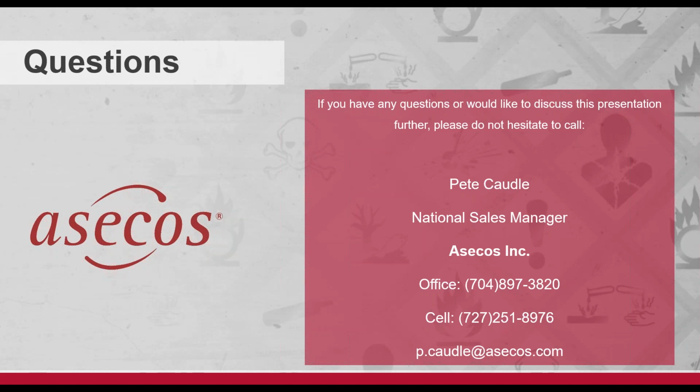But if it is a certified cabinet, I would get with the manufacturer and ask, have you done testing to the certification with them vented? If not, then I would try to figure out how to address that. I understand that can be a big budget ticket, but I would start with what cabinet it is, is it certified, and then I would get with that manufacturer.